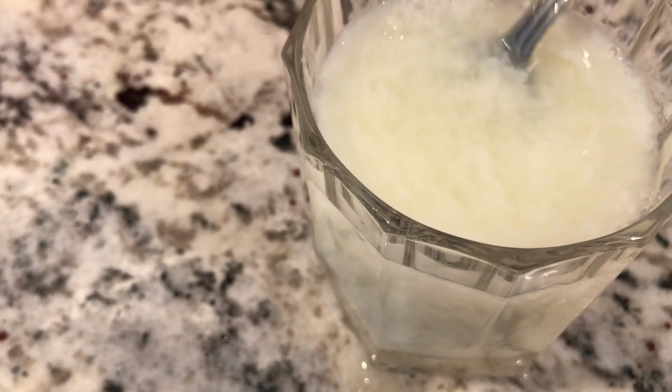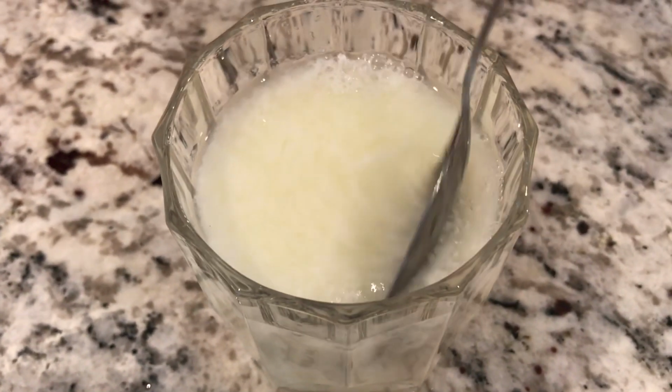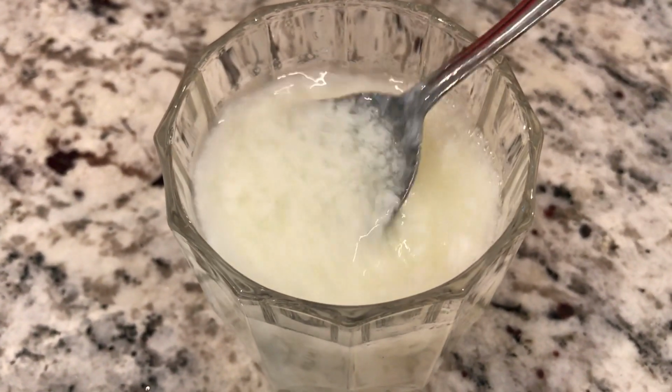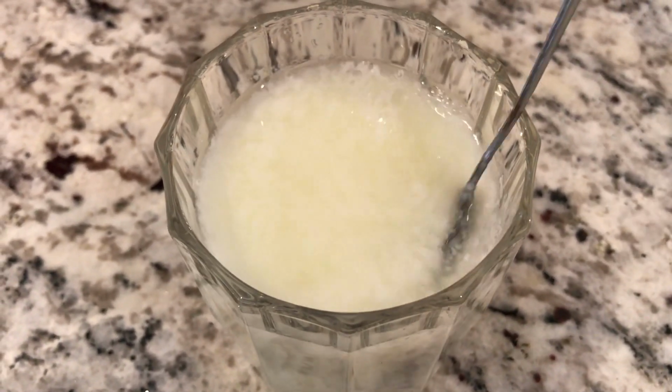Would you characterize those as bubbles? I wouldn't characterize those as bubbles. What would you call that? A new solid, right? The milk is curdling, right?